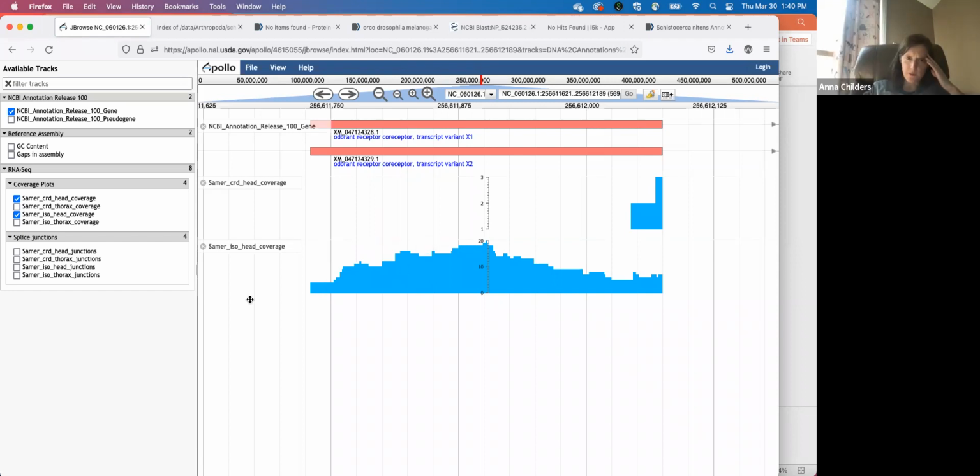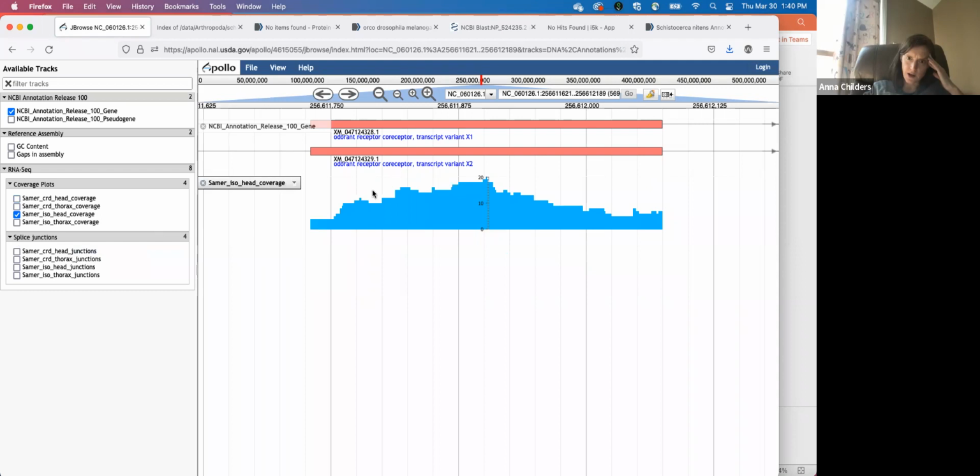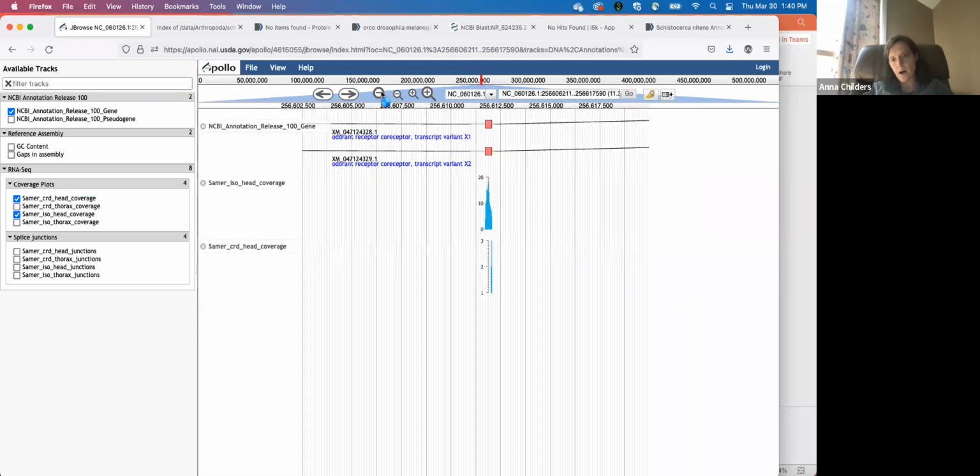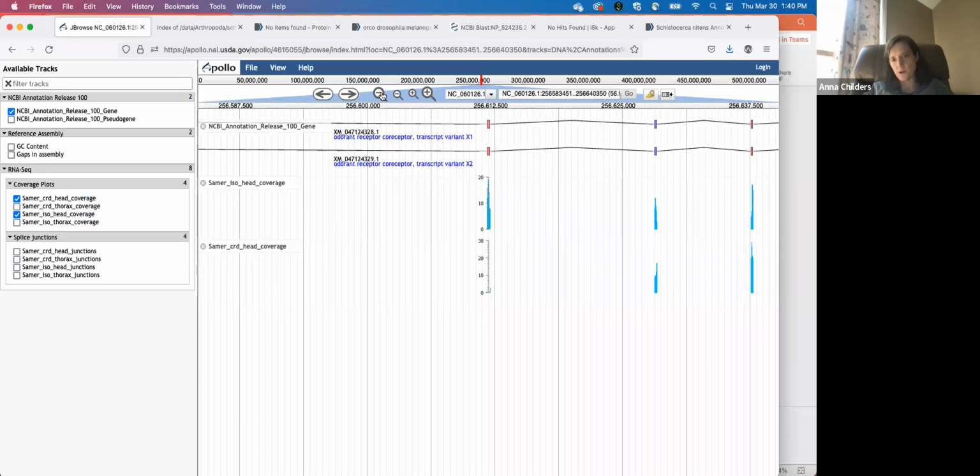But I guess, is it clear to anybody else here that, looking at this, I'd say that exon is well supported by the data from the isolated track, but using that crowded track, I would say that it's likely that there's an alternate splice form, that the entire exon isn't necessarily present in the transcript that's expressed in the crowded locus.